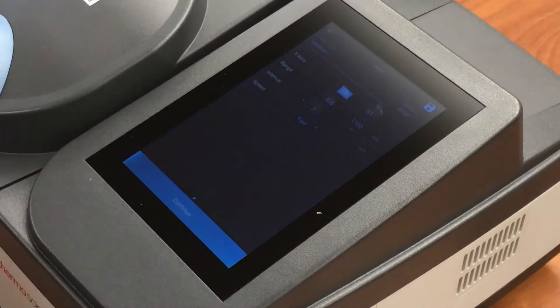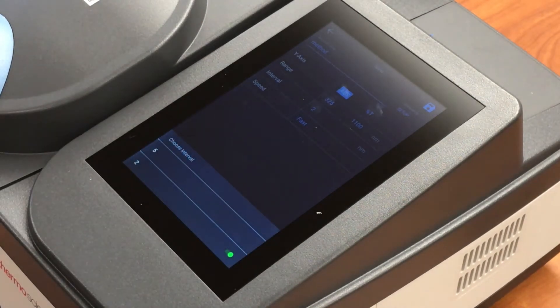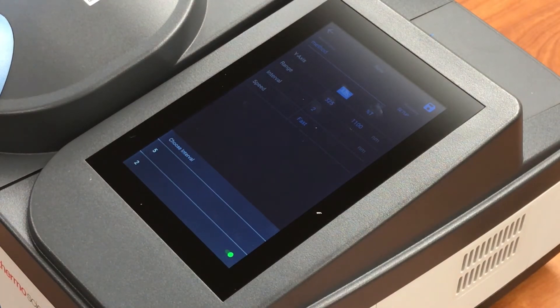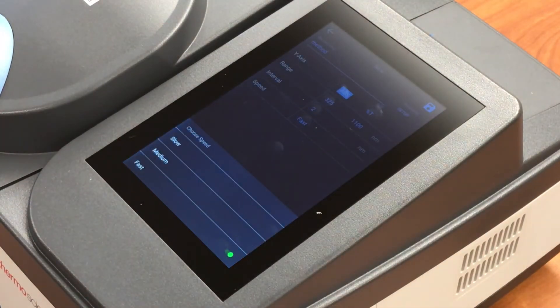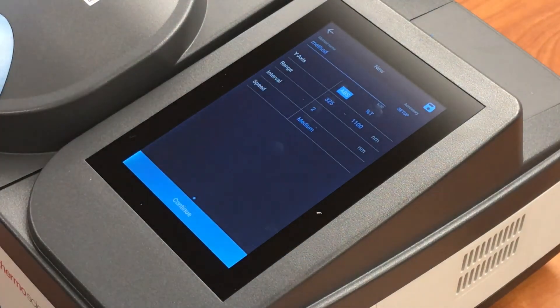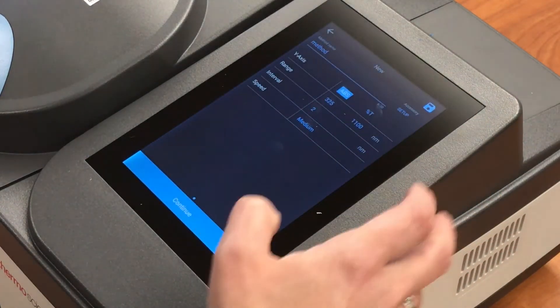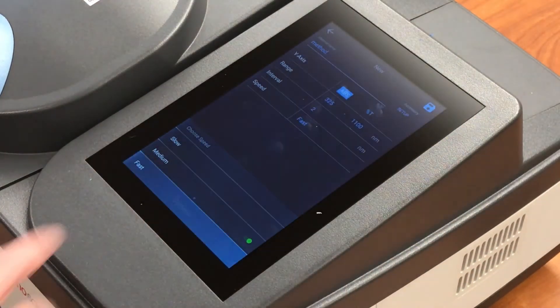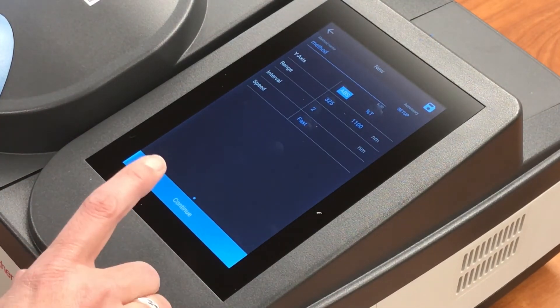If you touch that number, you can see the options that will come up. Using this fast speed, we have the option of a two nanometer interval or five nanometer interval. If we change the collection speed to medium and then go back and change the interval, you can see that we now have different options. For our purposes, we're going to use a fast measurement with a two nanometer interval, so we can click continue.